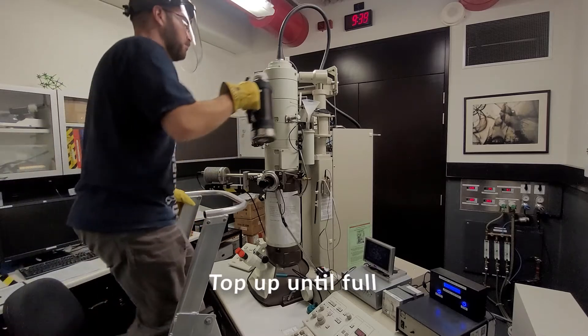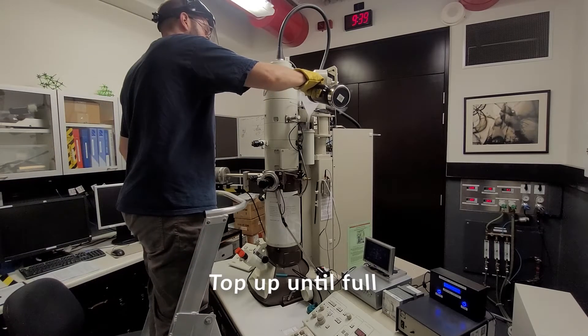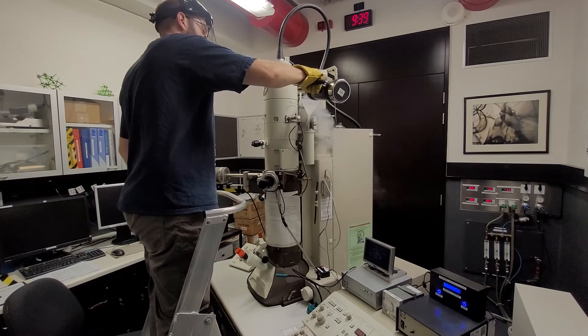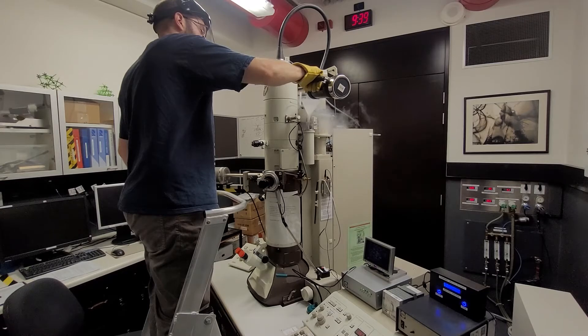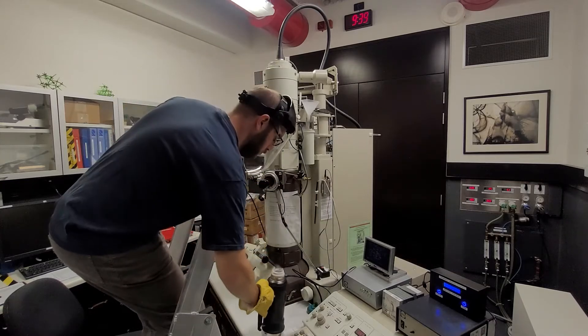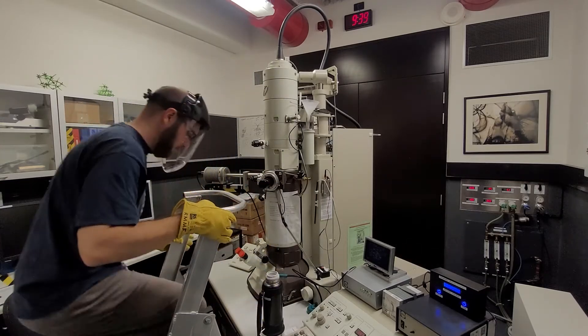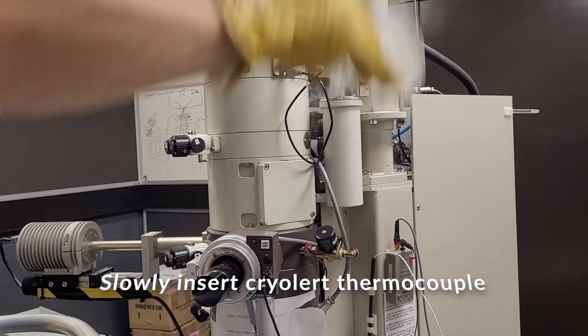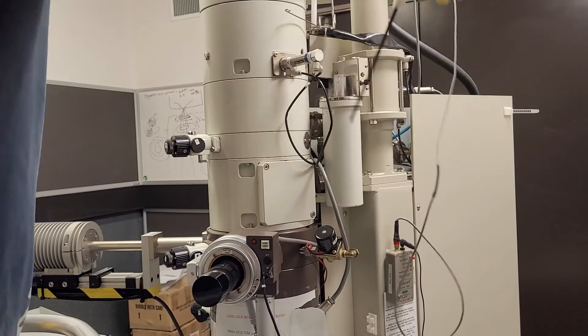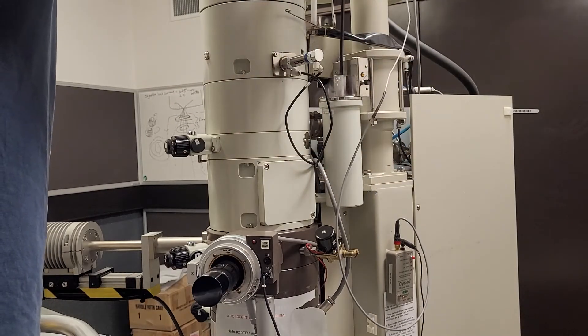Fill the cold trap the remainder of the way until it starts to overflow. Remove the funnel, then slowly insert the CryoLert thermocouple.